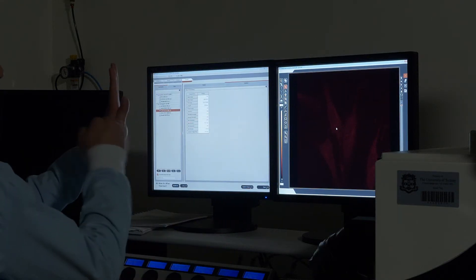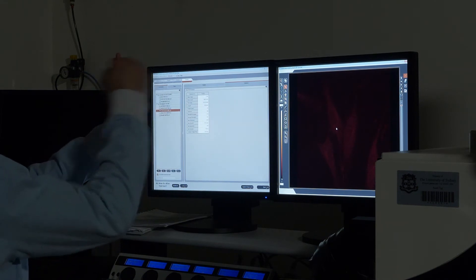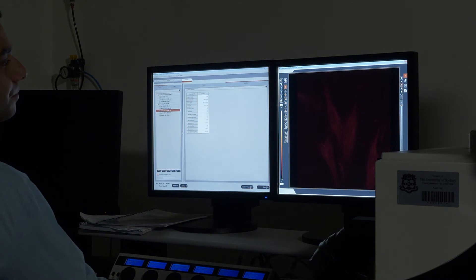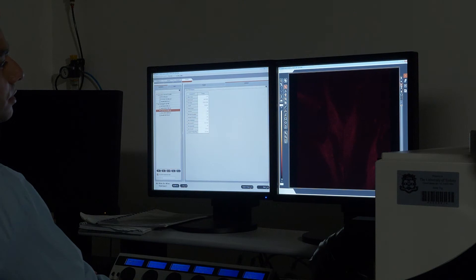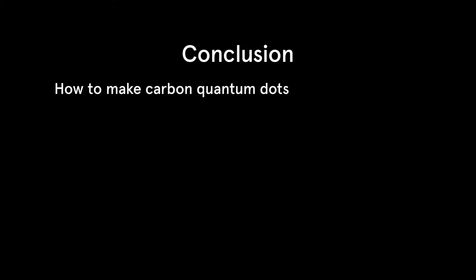A z-stack image — images of sections of the cells — was collected to exactly locate the z-position of the carbon quantum dots within the cells. The fluorescence dots can be seen within the cell cytoplasm by visualizing them on the z-axis from the bottom to the top level of the cells, which is from 0 to 27 micrometers. We can confirm that the carbon quantum dots penetrated inside the cell cytoplasm rather than being bound or absorbed on the cell surface.